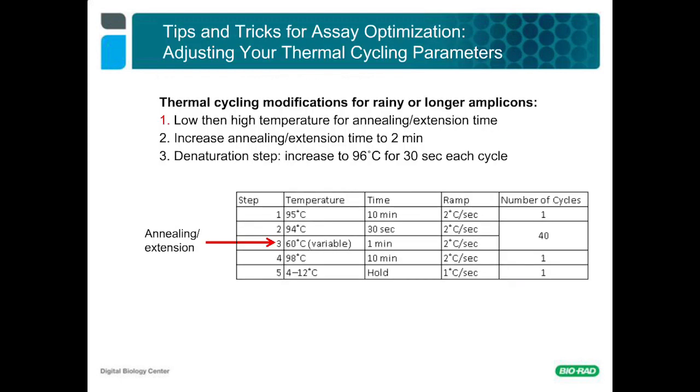So far, we have covered the assay design, the digestion of the sample, and now we will cover more suggestions for modifying the thermal cycling conditions. Different thermal cycling protocols have been developed for qPCR with names such as the 3-step protocol or a step-up protocol, and these same modifications can be made in ddPCR thermal cycling.